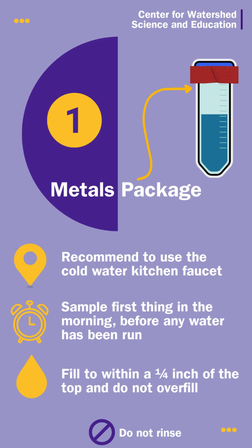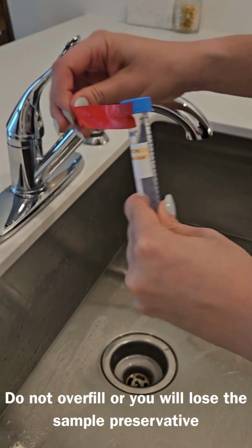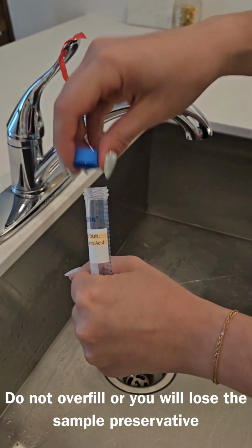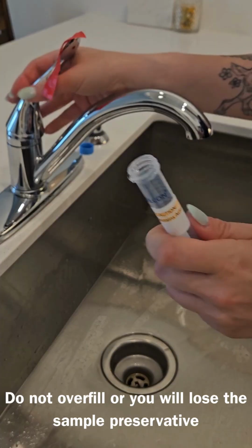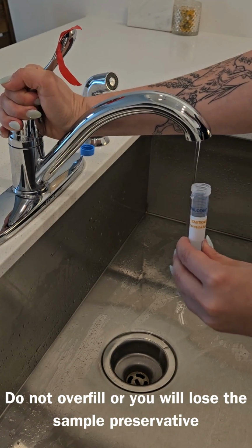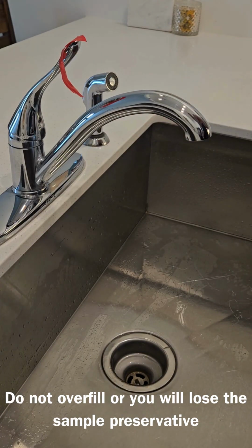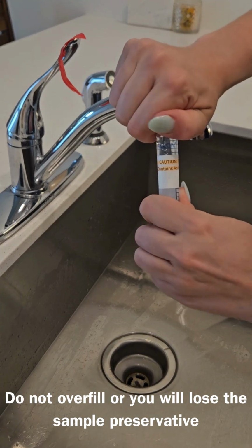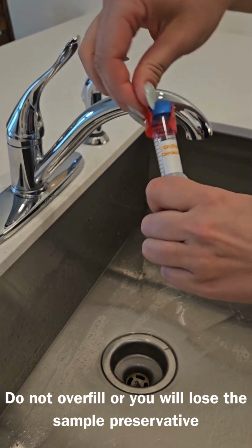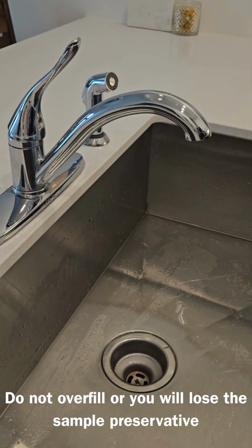When collecting the metal sample, gently remove the red tape from the cap of the metals vial. Turn the cold water tap on so the water comes out in a slow trickle about the width of a pencil. After just a few seconds, place the vial under the stream of water and fill to approximately 1/4 inch of the top of the vial. Do not overfill, as this will cause the loss of the preservative. Once the sample has been collected, replace the cap, ensuring that it is securely fastened. Lastly, replace the red tape around the vial cap.